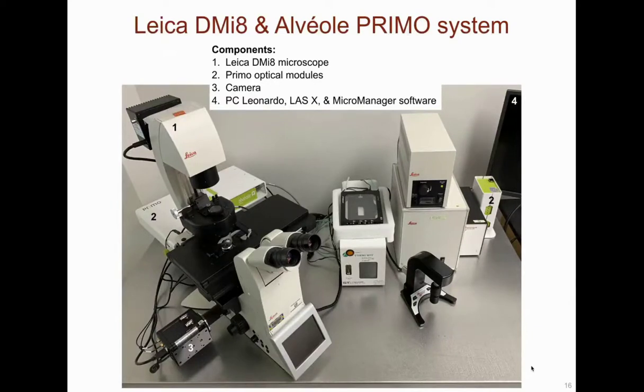The light microscope is a Leica DMI-8 onto which the Alvéole PRIMO micropatterning system is mounted. The entire system is very compact and also supports longer time-course live cell imaging experiments with the addition of an incubating chamber. This is a user-friendly system for imaging and micropatterning. The PC runs 3 main software packages: Micromanager for basic and custom imaging experiments, the Leica LASX for correlation experiments, and the Alvéole Leonardo for micropatterning.